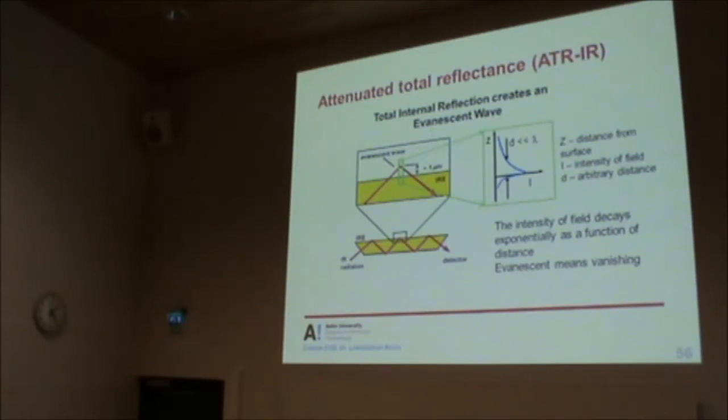Now, as we all know, the propagating electric field fluctuates depending on its frequency. So if you have any bonds in this region in the medium, and the frequency of the fluctuating electric field created by that bond matches the frequency of this incoming radiation, it is going to be absorbed.